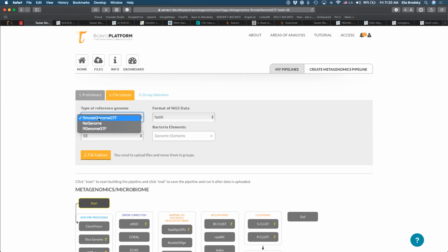Does anyone have any idea what we, okay, our genome. So in fact, we don't want to use a reference genome at all. We don't know genome right here. All right, great, Michael, got it. Now, is this single end or paired end?